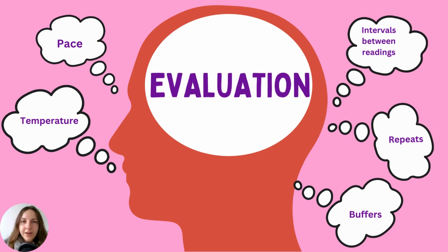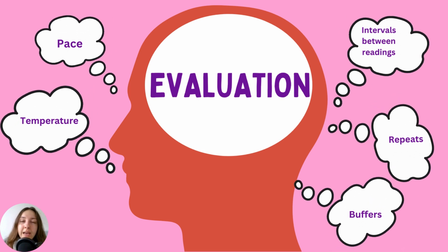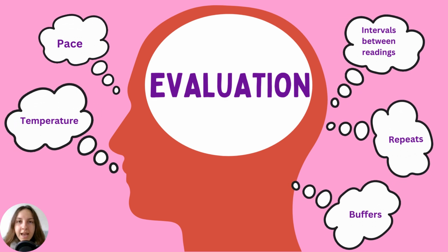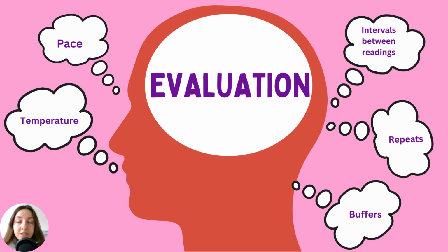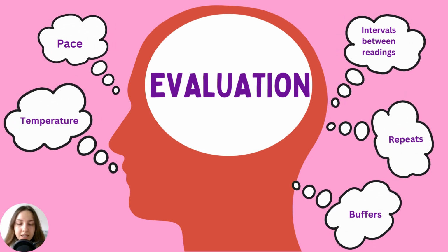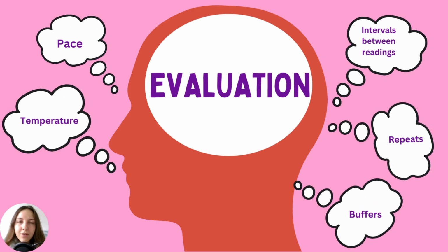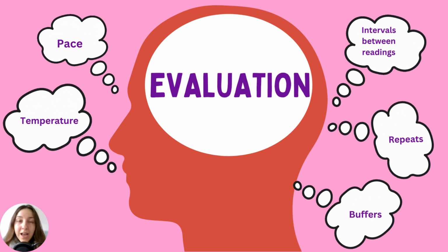So, this is the last part of the practical, which I would actually recommend everyone does, especially if you're going into or looking to go into A-level sciences. And it's the evaluation part. It's the bit at the end of a practical that tells you what went well, what the results mean, and what you could do to improve it for next time. And this is a really fundamental skill, because anytime scientists in the real world do any sort of practicals or anything that could actually benefit society, you have to write up a discussion piece, like a thesis, and write out your results, but also explain your results and how they fit into the current literature of what we understand in science. So this is actually a fundamental skill that actually happens in real life.